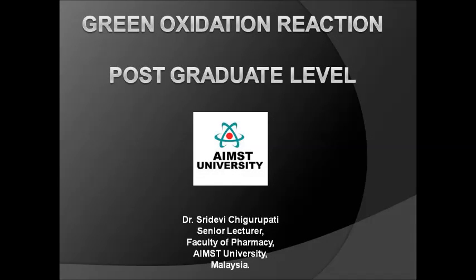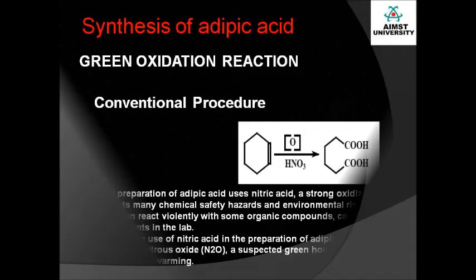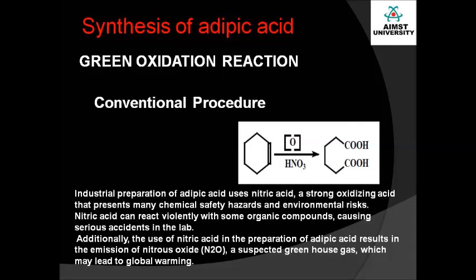I welcome you to the last topic of our second module, that is green oxidation reaction. This experiment can be designed for postgraduate level students. Here we are going to learn how to synthesize adipic acid. It is a green oxidation reaction. Let us see the conventional procedure of how we synthesize adipic acid.